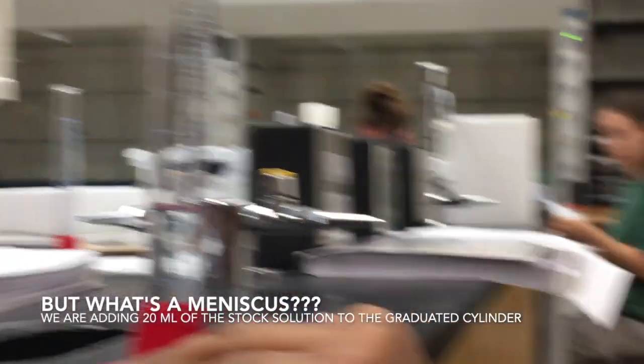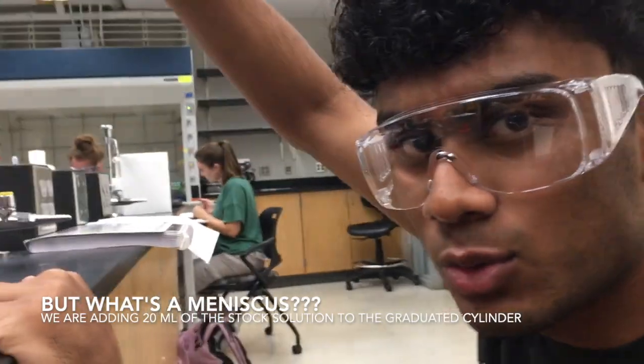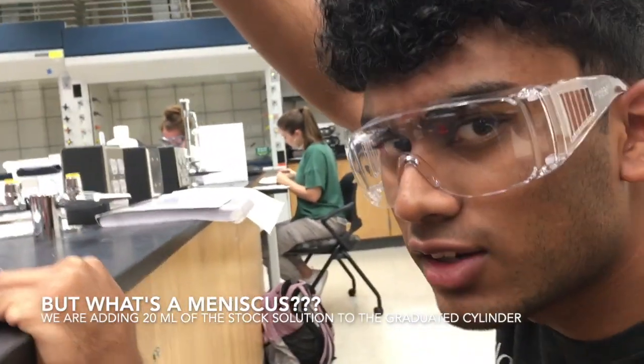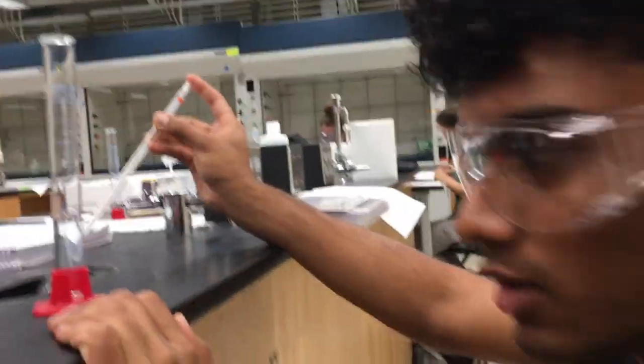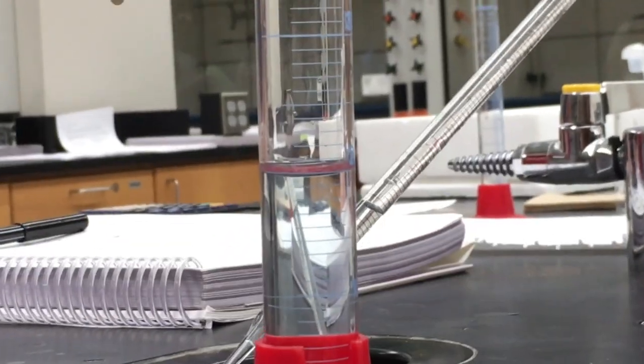So I'm watching for the meniscus because liquids tend to be cohesive and adhesive, but since they're cohesive, they sort of hold on to the edge. But that's why I look at the meniscus, because there's a bit of a range, and it's exactly at 20, so we Gucci.